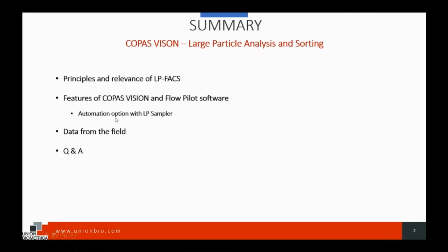And I will mention our automation option with our automated LP sampler, which is an accessory that can be purchased with an instrument. And then the fun part, where I will talk about interesting things that people are doing in the field with our technology. And then I'll be able to answer any questions that you may have.